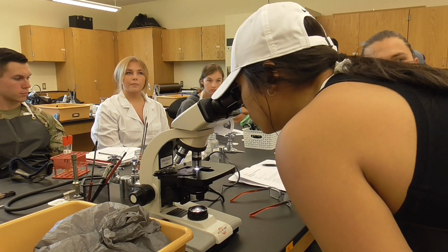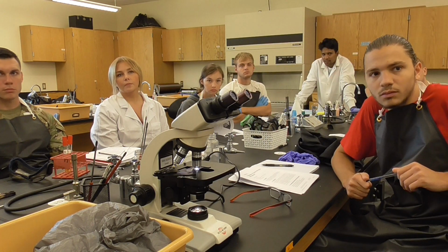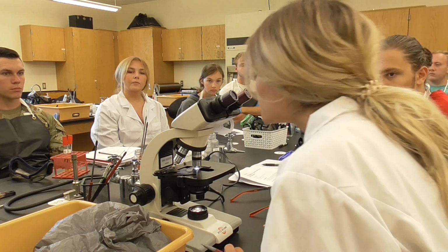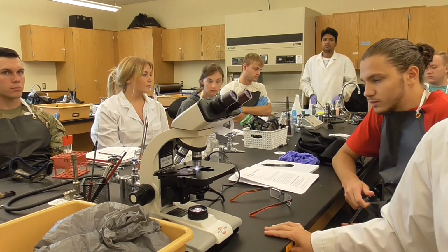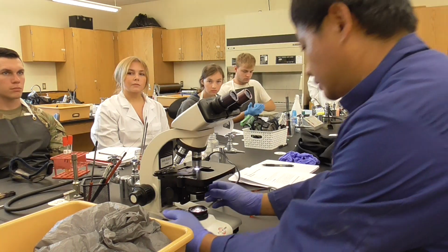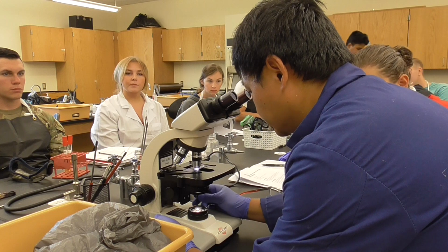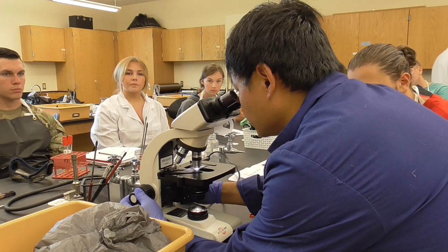What does that mean? That means that glass slides, you have to clean very well. Go ahead to see it. Can you see it? Yeah. That's 100x. Okay, now let's see whether we can see bacillus. So you can try your luck, just move around. Okay? See whether you can see it.